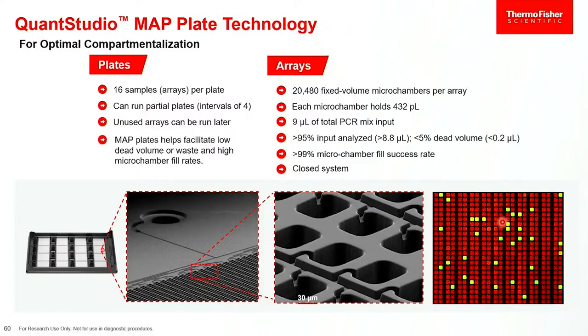Buy a tube of that. We have a master mix for qPCR. You can buy that. You put all those together in a tube. Those tubes go on the instrument. In both cases, either the bulk reaction gets loaded here, or you put it in a plate and it goes on the qPCR system. From there, it's hands off. You don't have to do anything else except come back and collect your data.